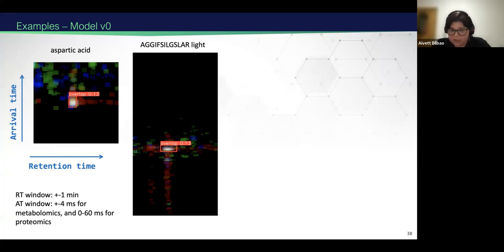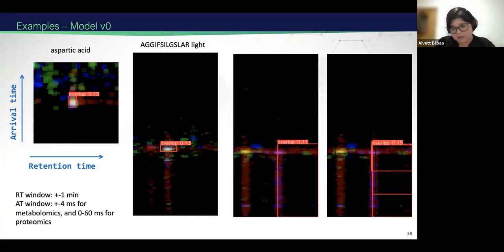But we can see here that this first iteration of the model, trained with only 50 images, because it's laborious and time consuming to generate this training data, is able to detect the white regions, the overlaps, even if the probability is low. The model is not very confident. So 0.1 is not really great. And also the model did some crazy stuff, which we don't know what it was training on, but it's okay. We only trained with 50 images.